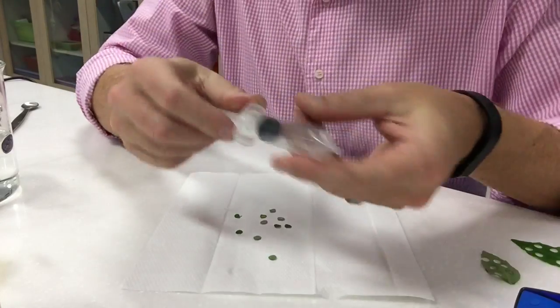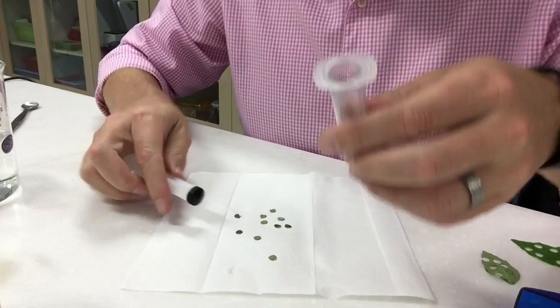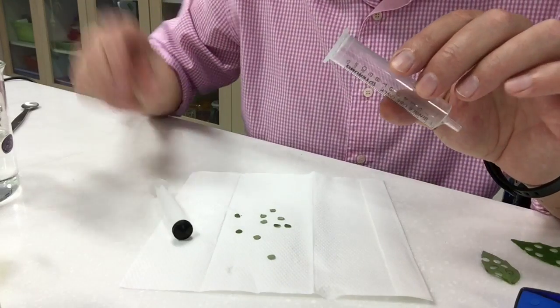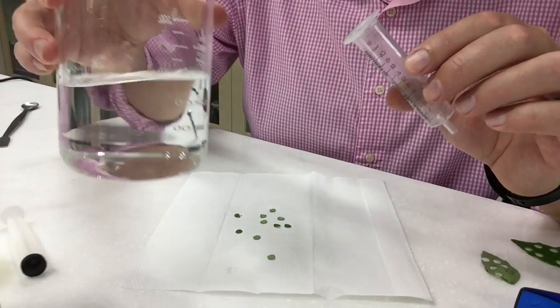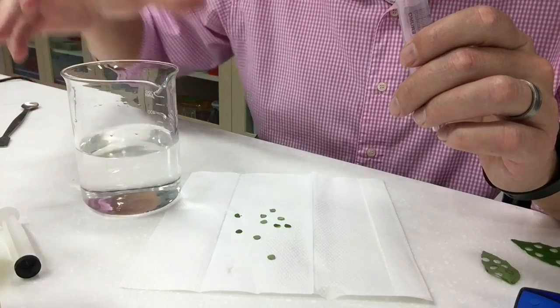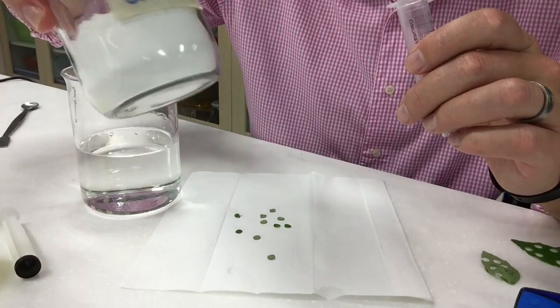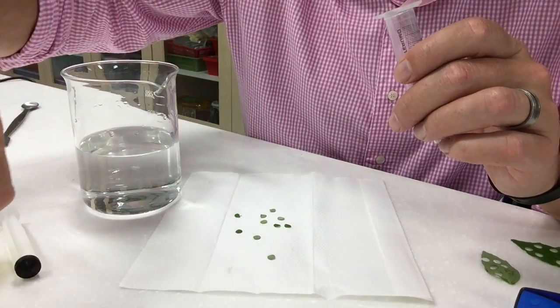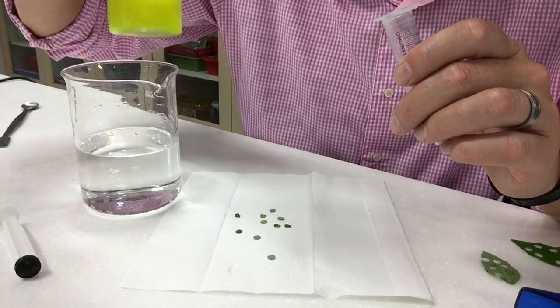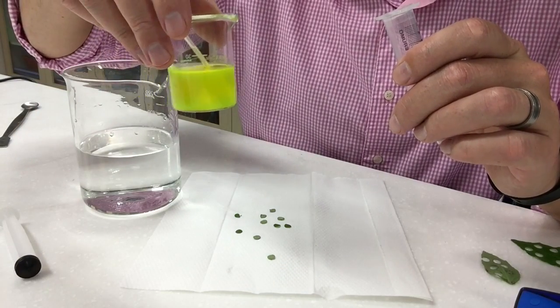So what you need to do is you need to take a syringe, 10 mil syringe, and take out the plunger. Now I've already created this solution but this solution is about 500 mils of water with about a gram of sodium bicarbonate and a number of drops of detergent.